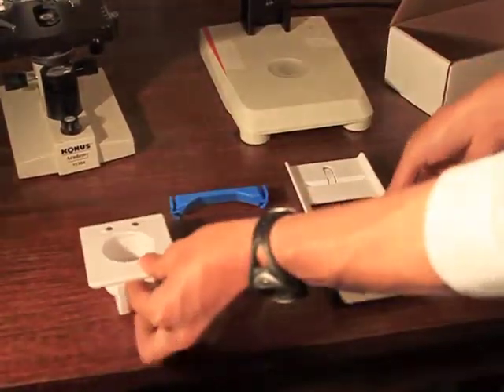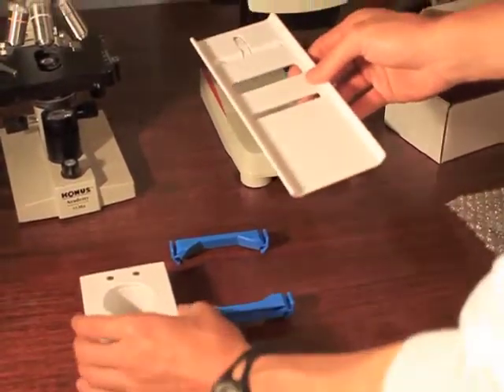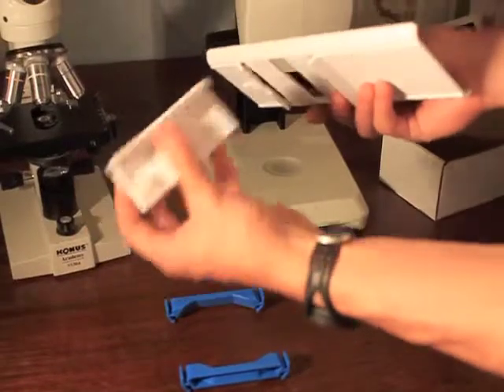The second component is the stage. The stage is what your cell phone rests on, and the stage can slide with respect to the base, like this.